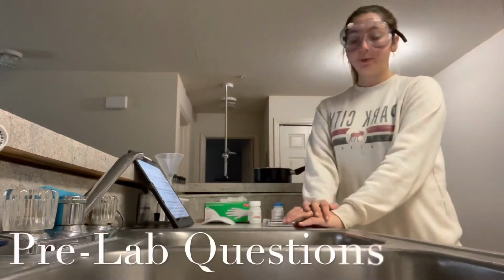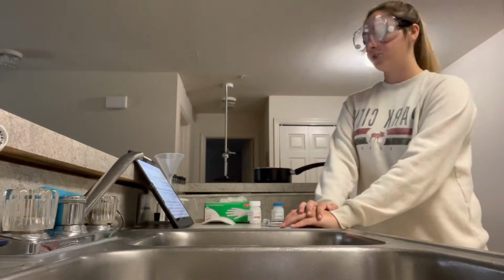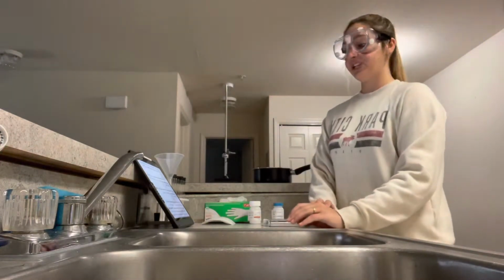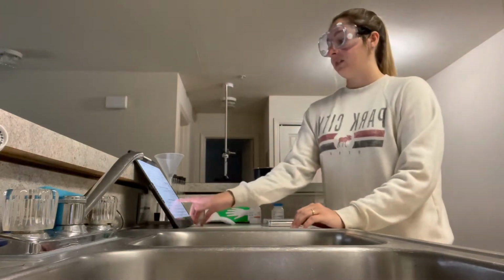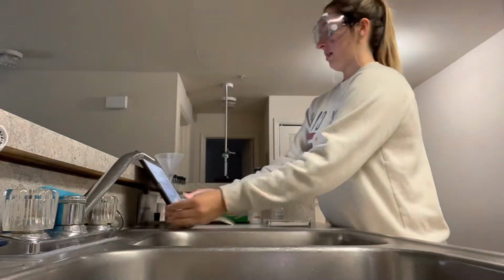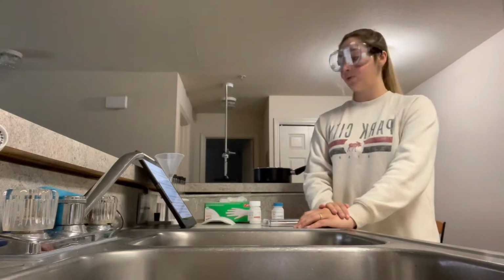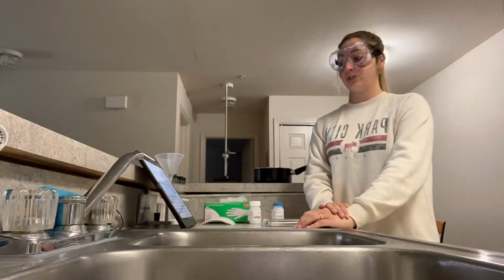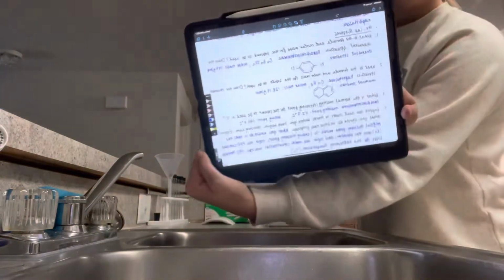Alright, so for our pre-lab questions, what is the formula and molar mass for the solvent to be used? Draw the chemical structure. So paradichlorobenzene will be C6H4Cl2 and the molar mass is 147 grams per mole. The chemical structure is as stated in my lab notebook. Now number 2, what is the formula and molar mass for the solute to be used? Draw the chemical structure. Naphthalene is C10H8 and the molar mass is 128.17 grams per mole. And our chemical structure is as shown in my lab notebook.